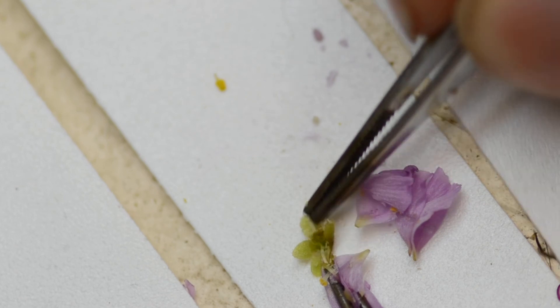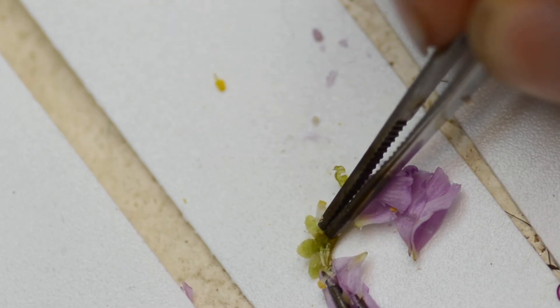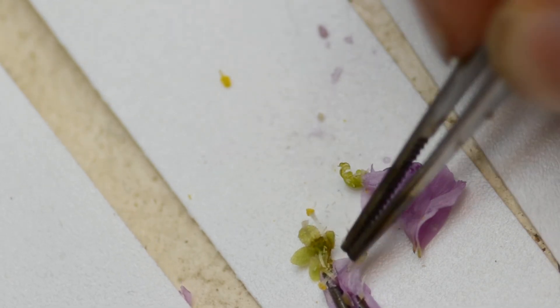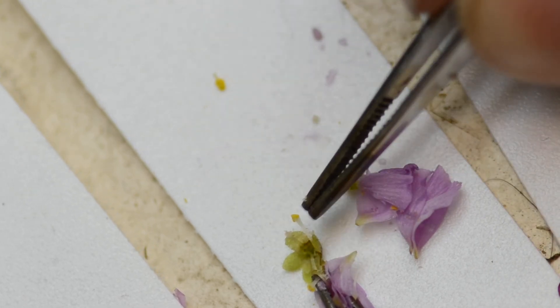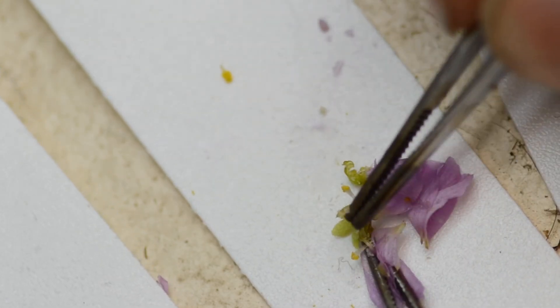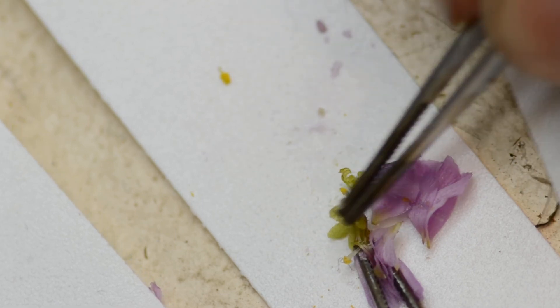So the plated region beneath the ovaries is the receptacle right here. It's kind of like where the ovaries connect onto the stalk almost above the sepals.